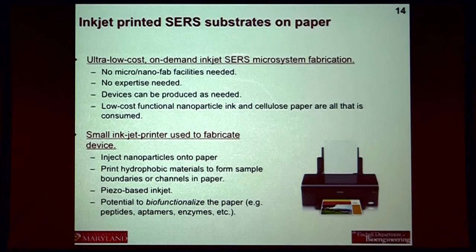But using inkjet printing, and specifically piezo, we're basically just injecting particles into paper to create these nanostructures. We can actually use the same printer to print hydrophobic features, so we can control where the sample can go and where the sample can't go on a piece of paper, and we've done that. Where we really are right now is, in addition to plasmonically functionalizing the paper, also biofunctionalizing the paper using the same printer. So we're making inks that actually deliver biomolecules to the paper so that we can do diagnostics that way.